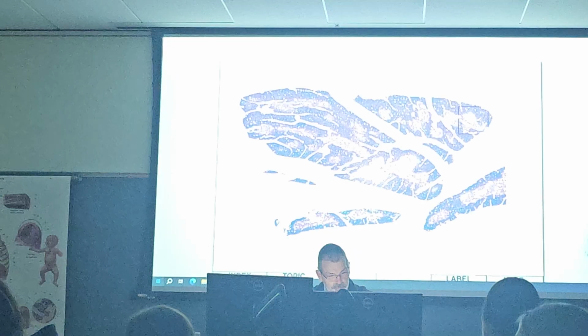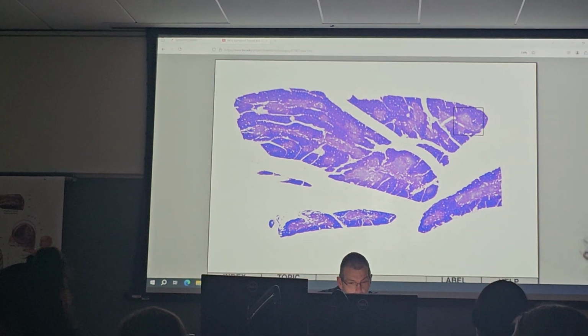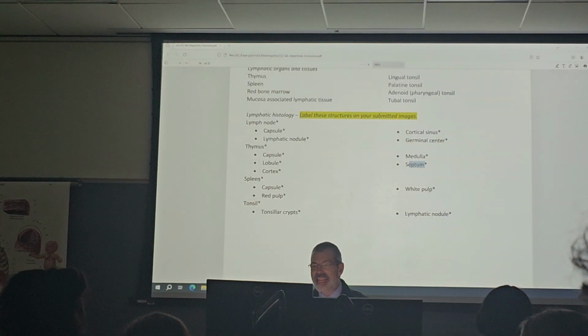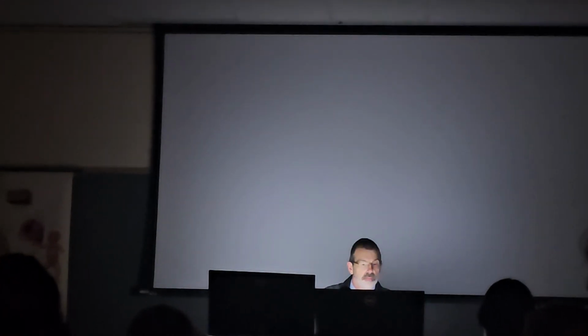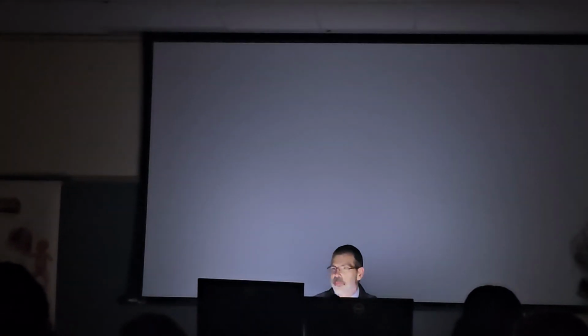Our next one is, boom, spleen. Okay, 3 things on a spleen. You will either love a spleen or you will hate a spleen. I'm hoping you love a spleen. Maybe not, because I think I lost my spleen. I lost my spleen. All right, all right.